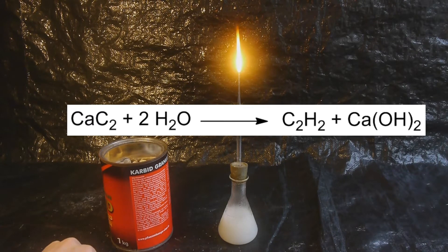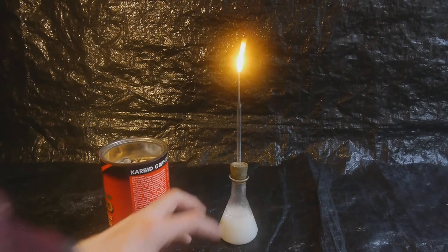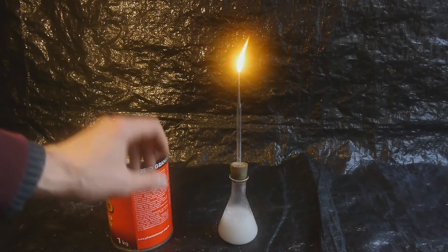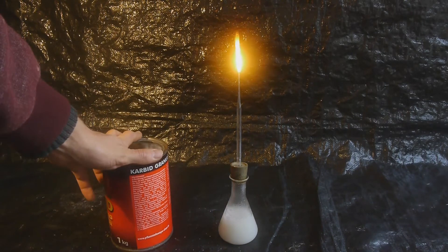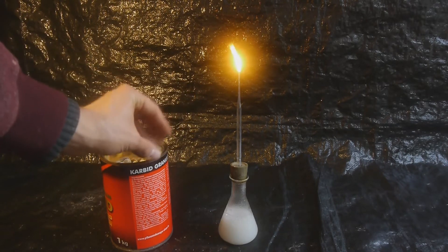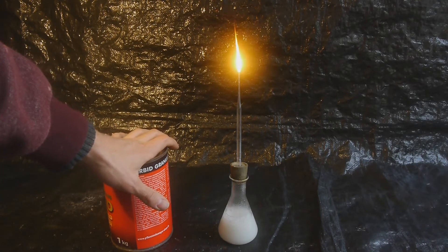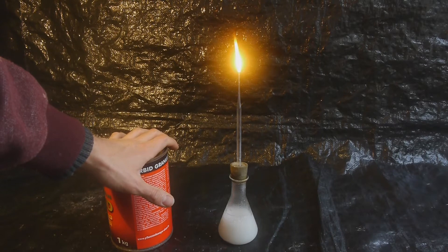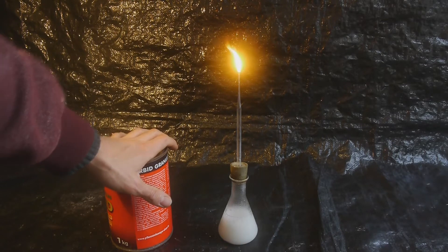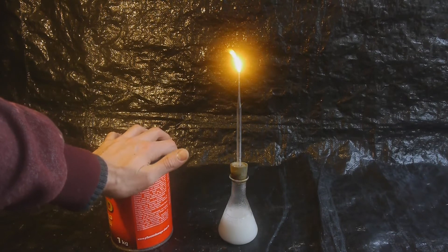This flame will keep on burning for quite a while — that's why it was used earlier to make lamps. At a certain point this method was used to make bicycle lamps, which is kind of hard to imagine today. The entire room is now getting filled with black soot, which is not ideal, so I should probably move that outside.